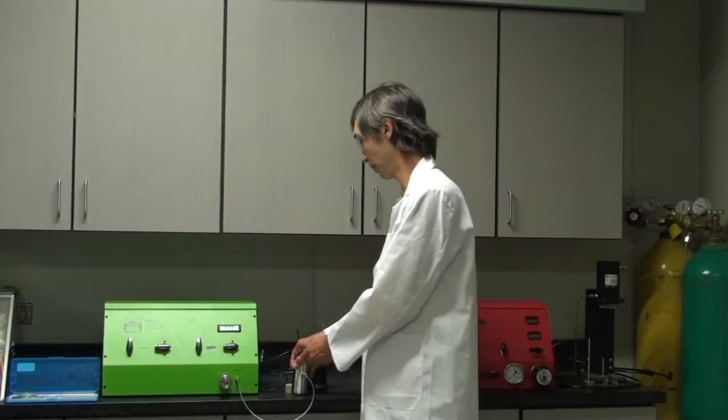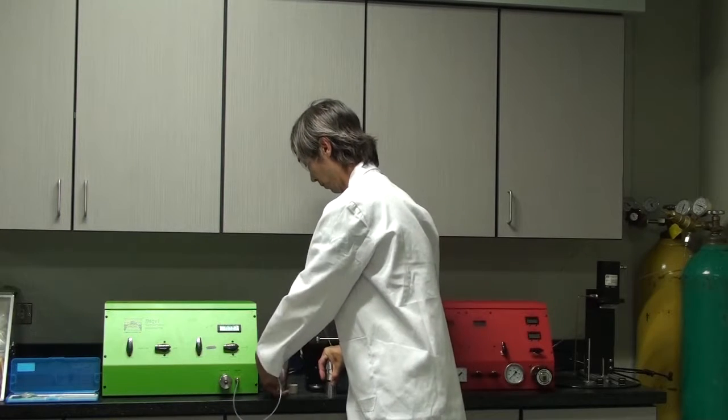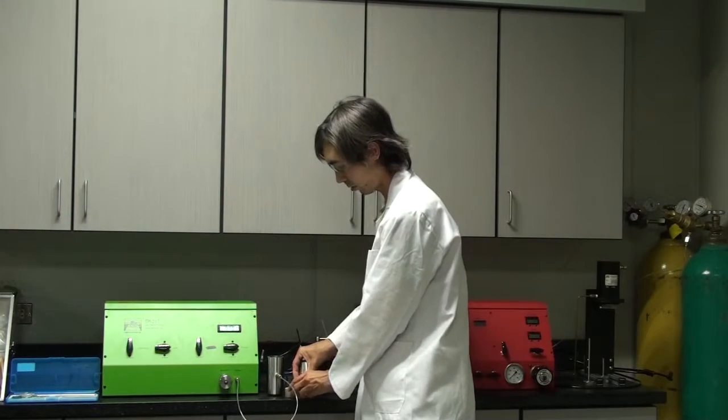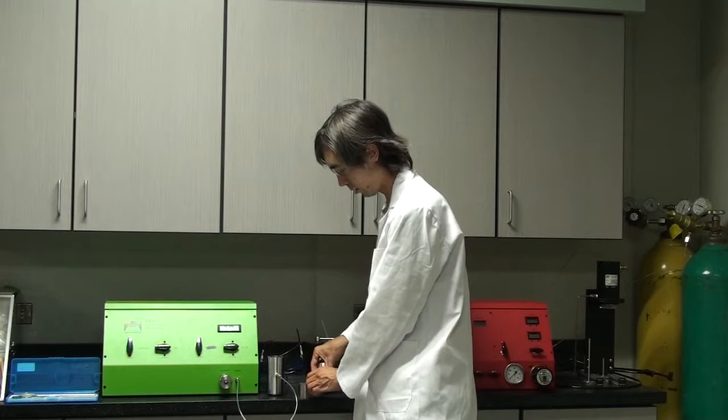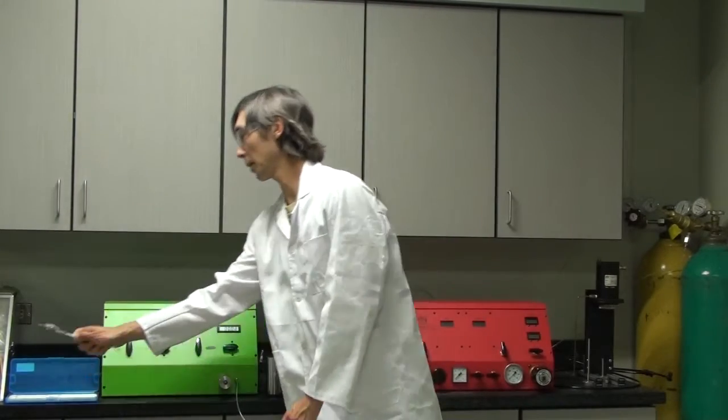Using the provided stainless steel billets, create a stack next to the sample of equal height or taller. This is our core. Return the stainless steel billets used to build the stack back to the core holder. Determine their volume of billets by caliper. This is our caliper, and by measuring the dimensions we can get the volume.